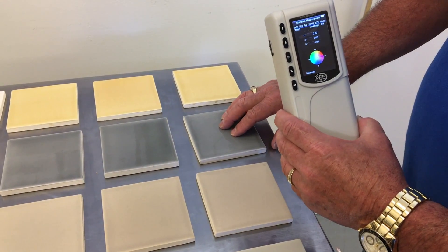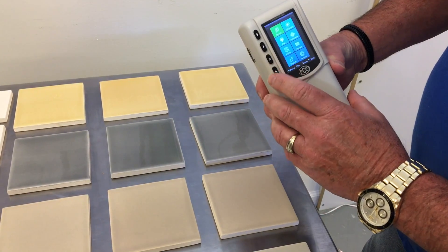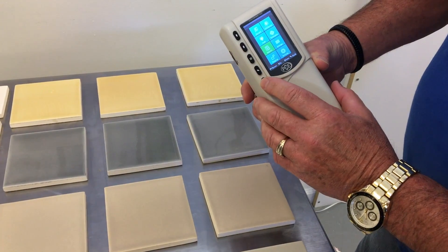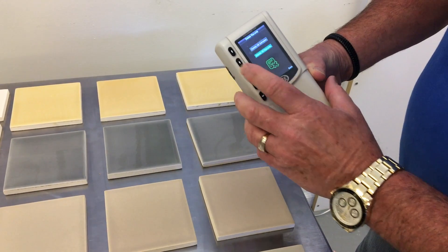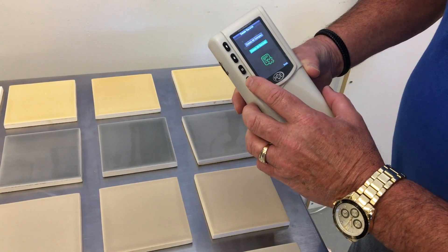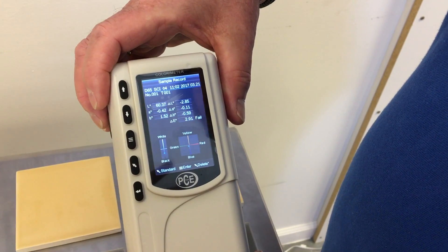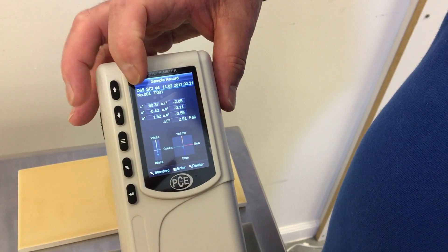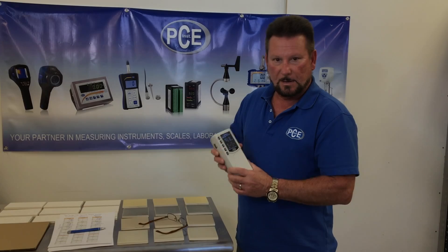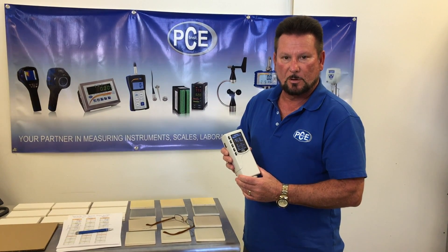Now we're going to move up to this gray standard, which means that we have to delete all records and reestablish our starting point with this color. So we go into menu, go down to delete, enter, delete all records, go down, enter, delete everything — yes. Now we're ready to set our new standard and record our standard. If you want to look at your readings, you can go into the record menu. As you can see, the PCE CSM1 color meter is easy to use, and if you have any questions, give us a call and we're here to help.